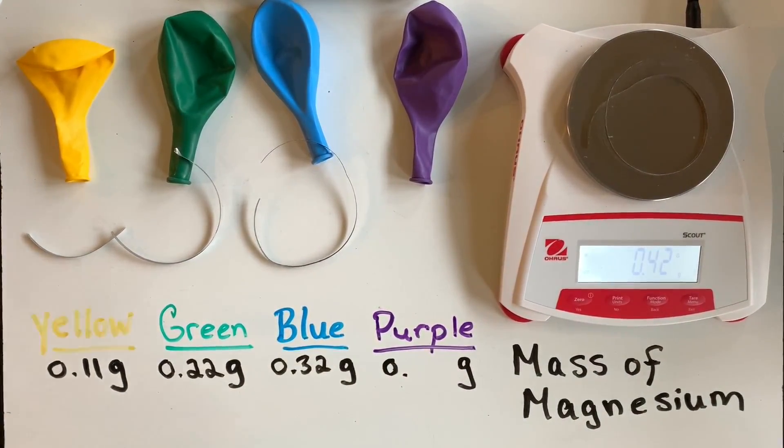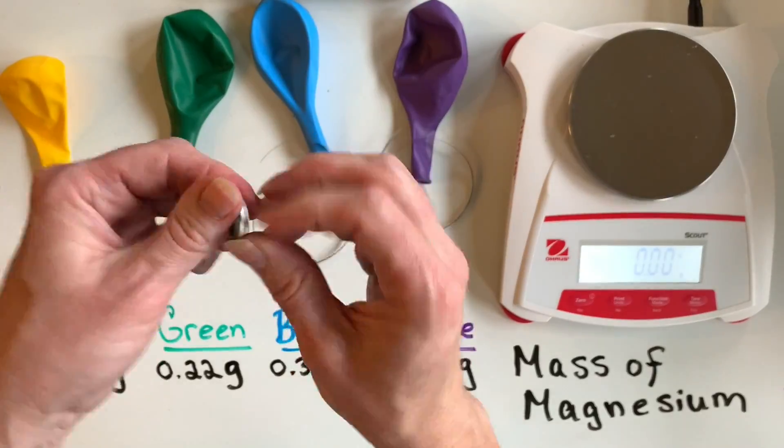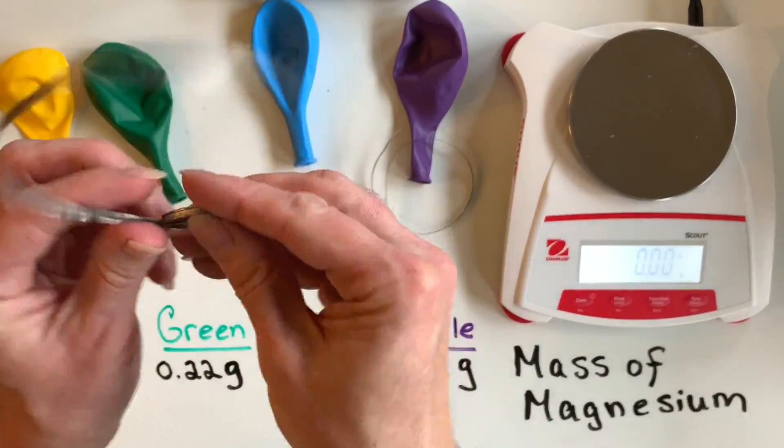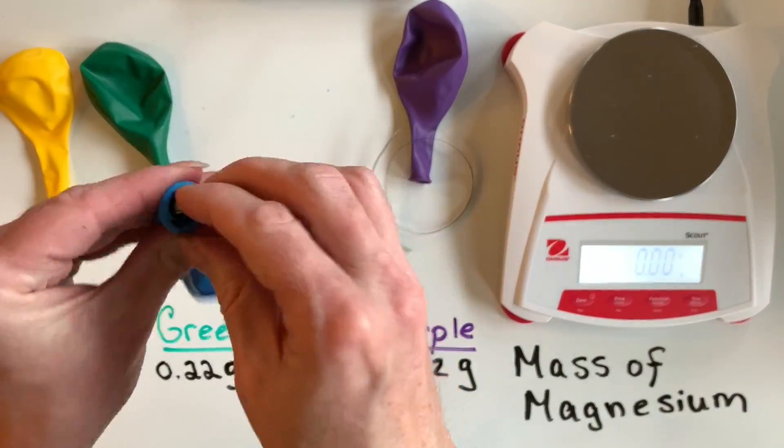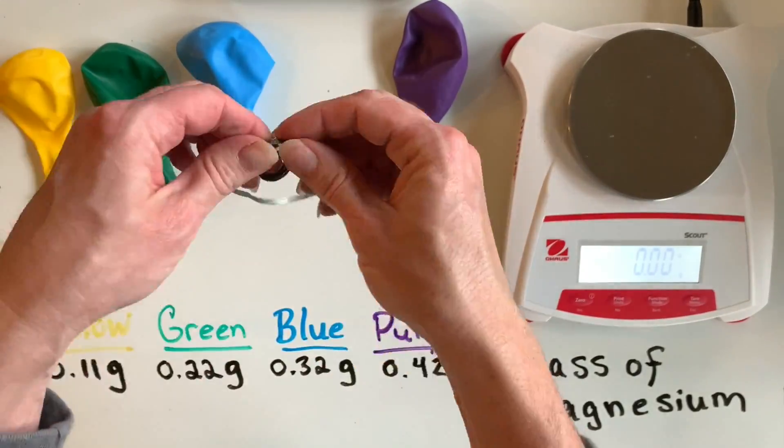I would recommend recording these masses for any future calculations. The magnesium samples were coiled and then placed inside the balloons so they could be easily dropped into the hydrochloric acid solution that will be inside the Erlenmeyer flasks.